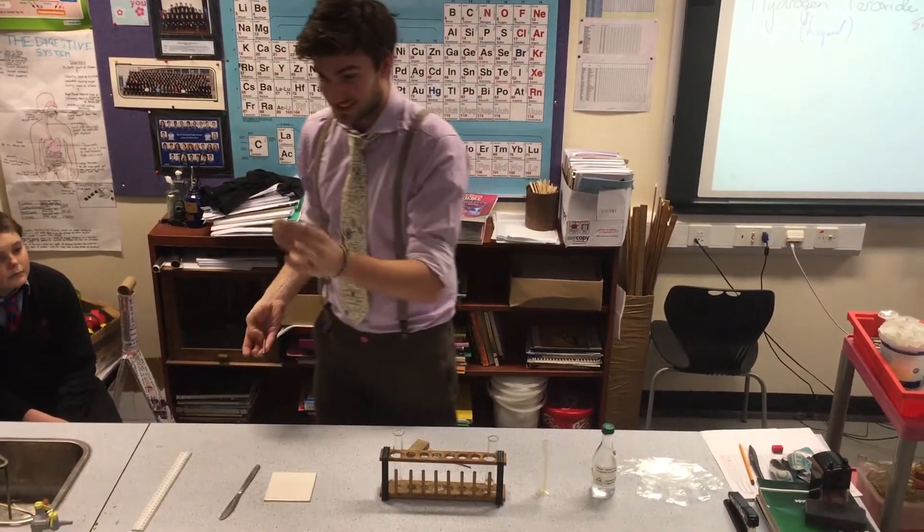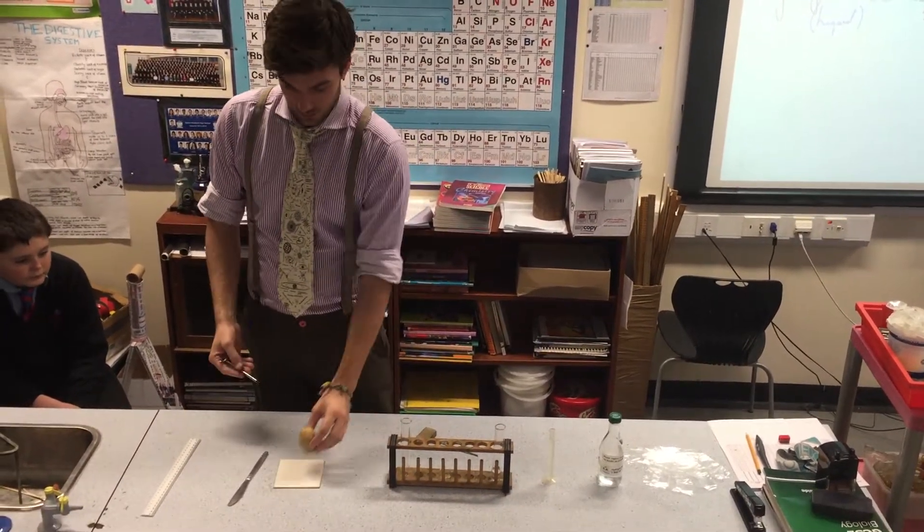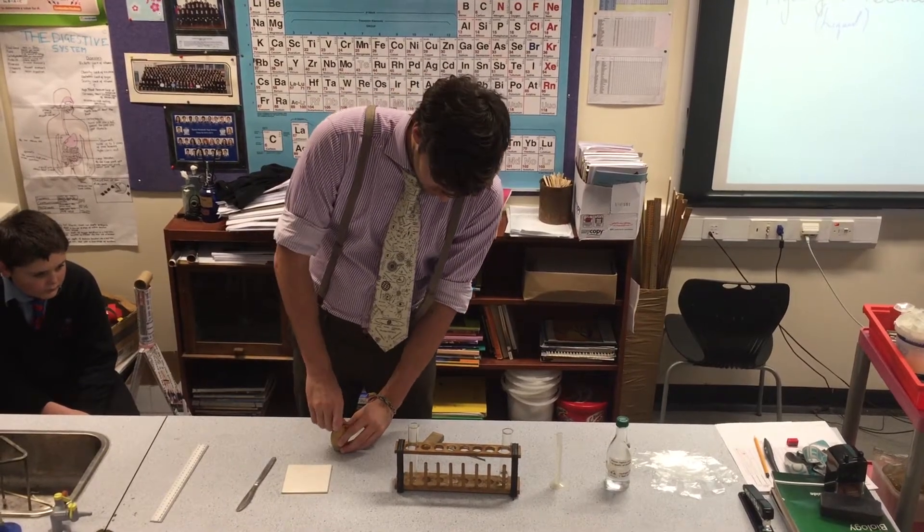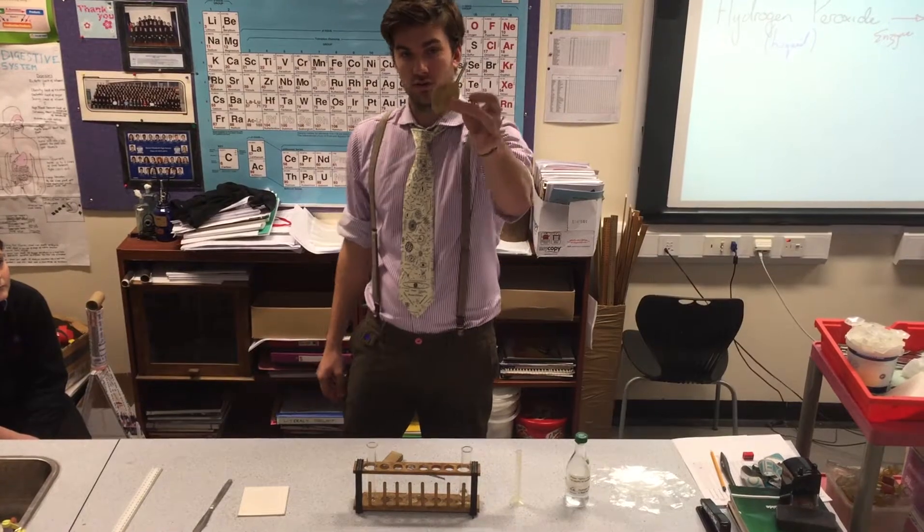So what is the easiest thing to do, is if you put that onto either the table or the spotting tile, push down gently, and you'll see the cork borer has gone straight through.